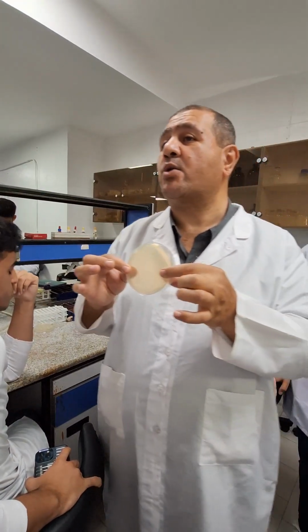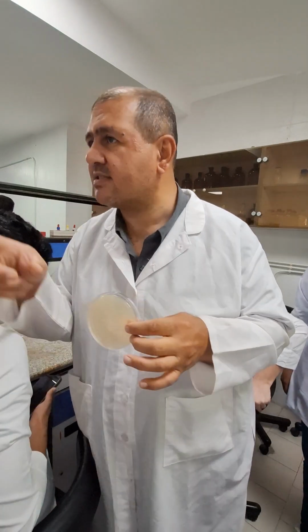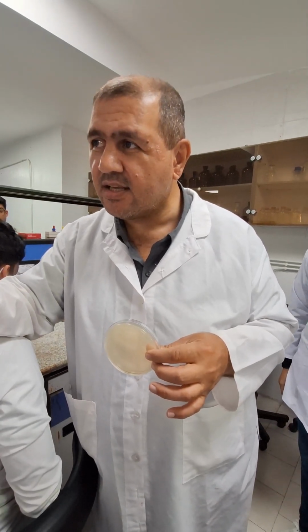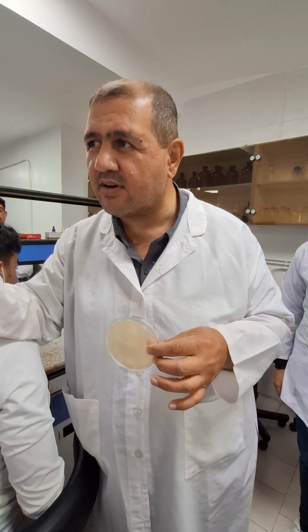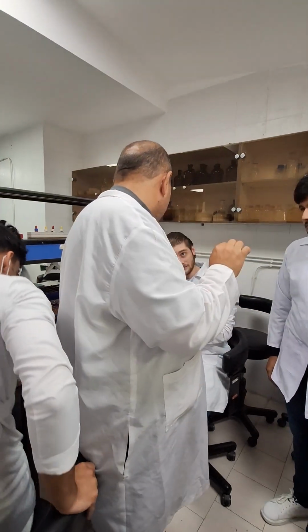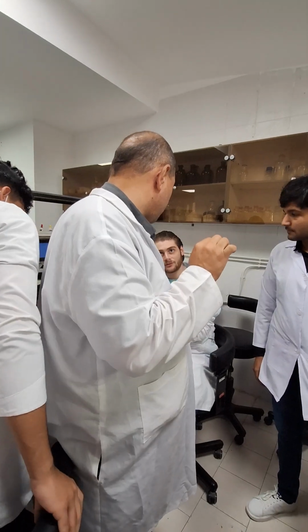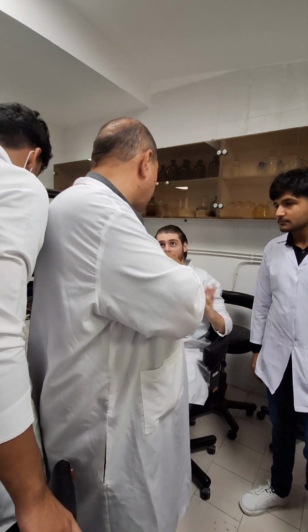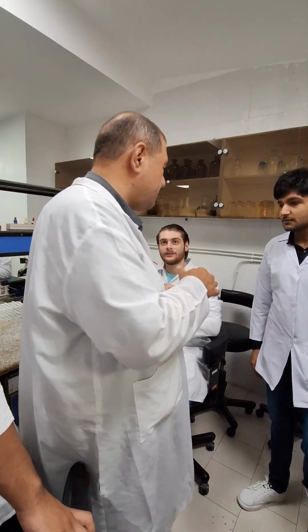It supports the growth of non-fastidious bacteria. What is non-fastidious? Those which do not have very specific nutrient requirements. In Farsi, non-fastidious is غیر سخت. Fastidious is سخت. Okay.